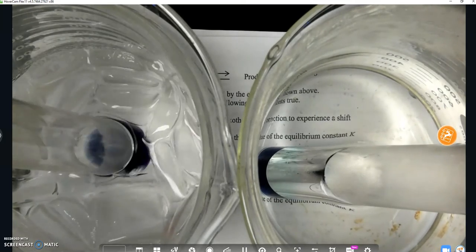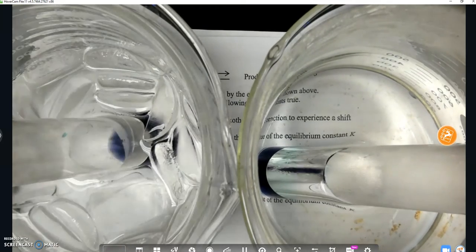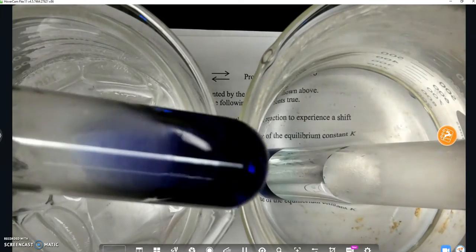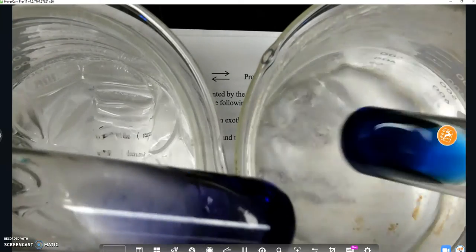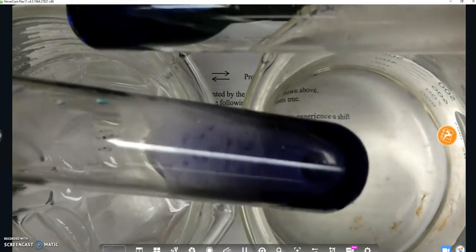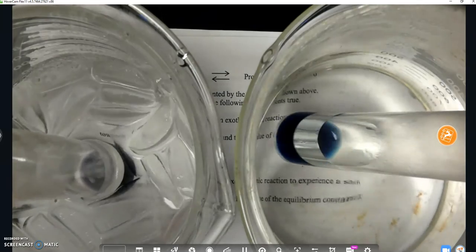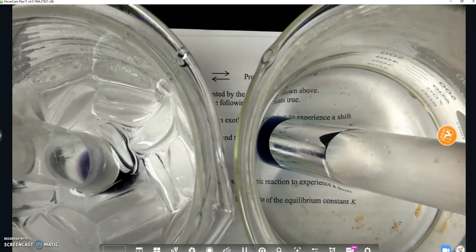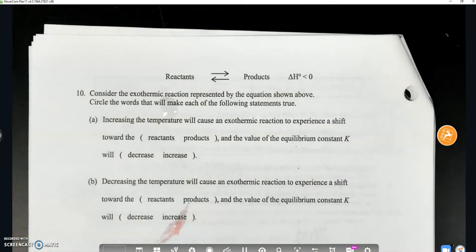You can't really see that yet. I can see it. It's turning back to violet, and it will turn back to red. So let's see if we can. In fact, can you see? Let's look at the difference between them. This is the blue. That is now violet. So this one on the bottom went from the bright blue color that it had in the heat, and now it's transitioning through purple. And if I let it sit in the cold long enough, what we know is that if you cool it, it shifts pink. Okay?